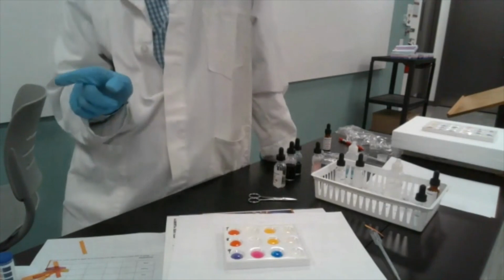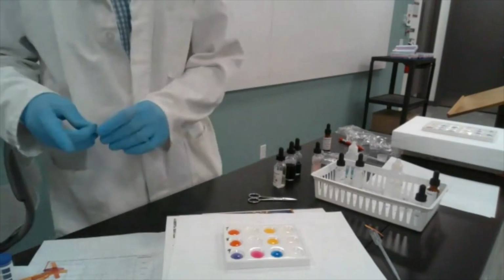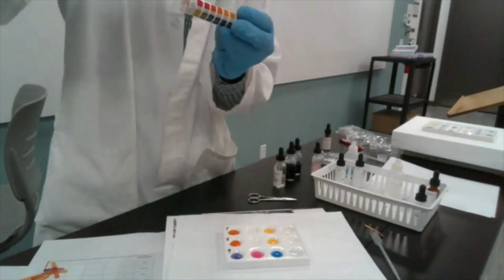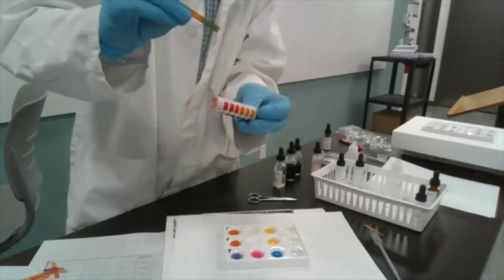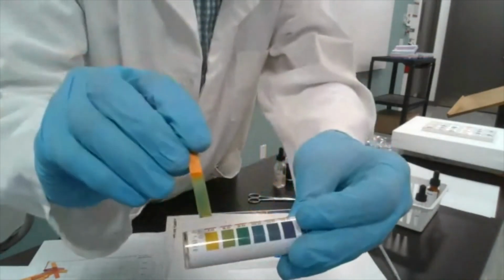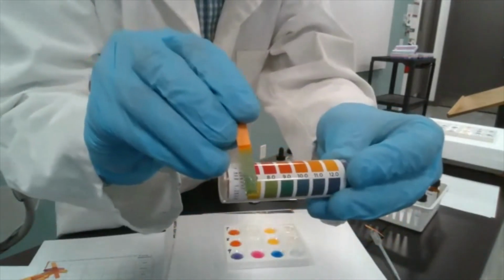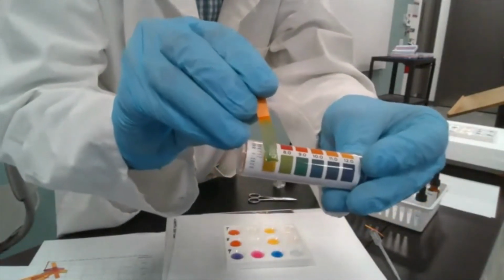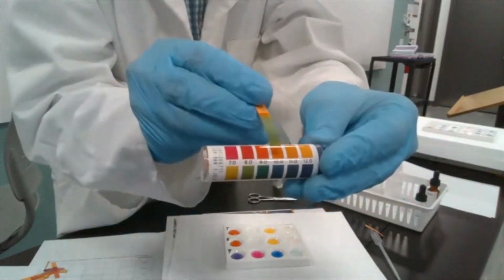So what is it about milk? Well, you may already know the answer, but let's do the pH strip test before we draw any conclusion. I'm just going to rotate it so it soaks up the liquid evenly. Okay, so I'd say this is pH maybe 8. So you see that milk has pH that is slightly different from 7.